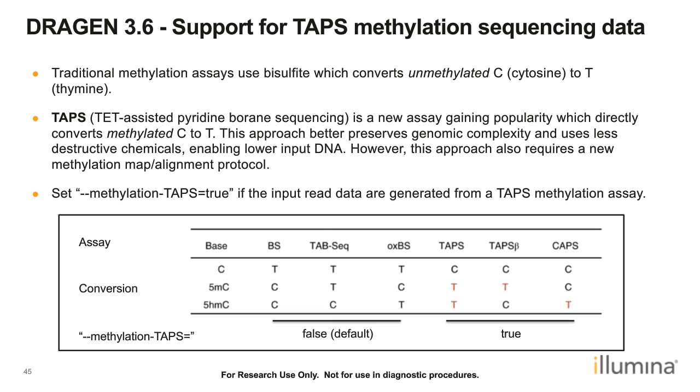It reduces the mismapping rates, and at the same time it becomes suitable for analysis of liquid tumors or ctDNA kinds of applications.